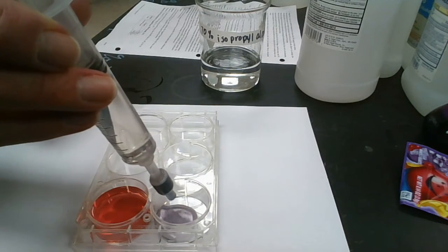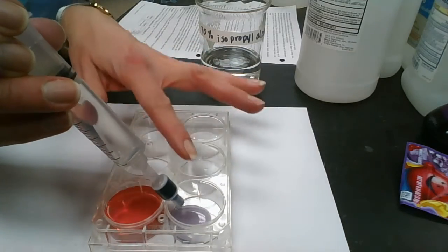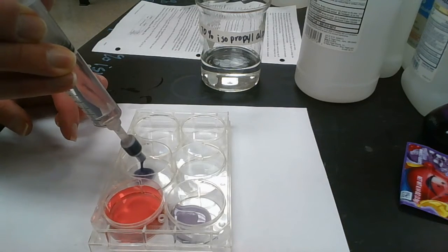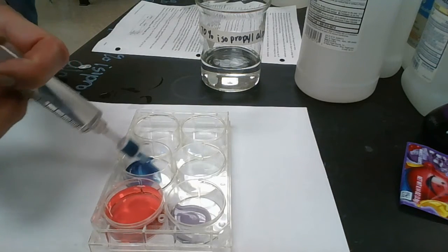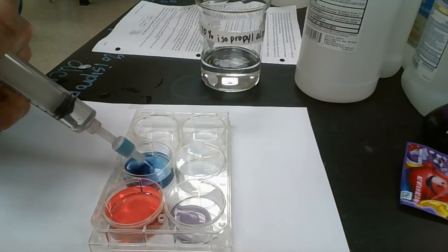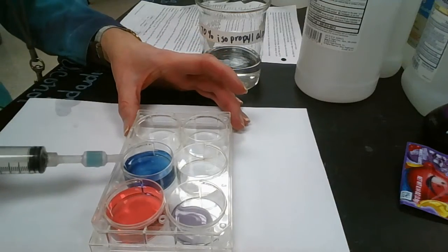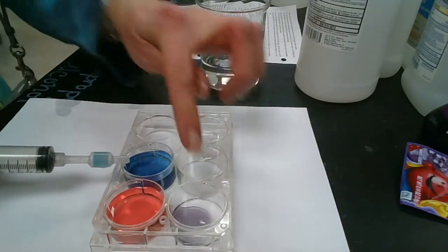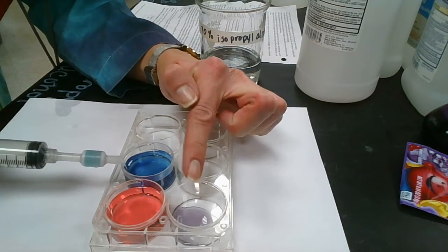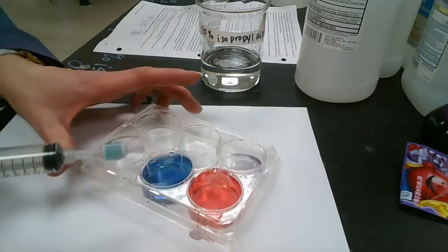Ooh, I had a little red coming off first. So I might switch it up because I could see just a tish of red there. And so that might be a little bit mixed. I'm going to switch to a new well plate because I want to show you basically all blue dye coming off of there. You can see in the middle, I had maybe just a little bit of mix in red and blue, and I didn't want them. You can see I had a little bit of purple in the middle, and what I wanted was a really good separation.